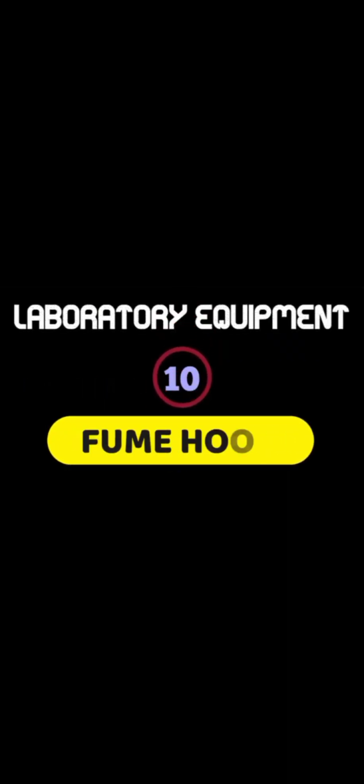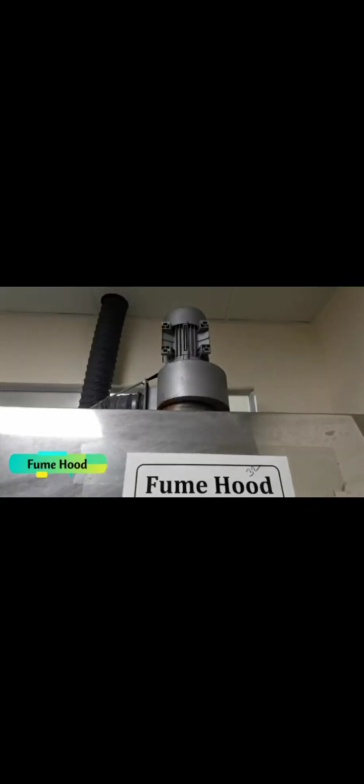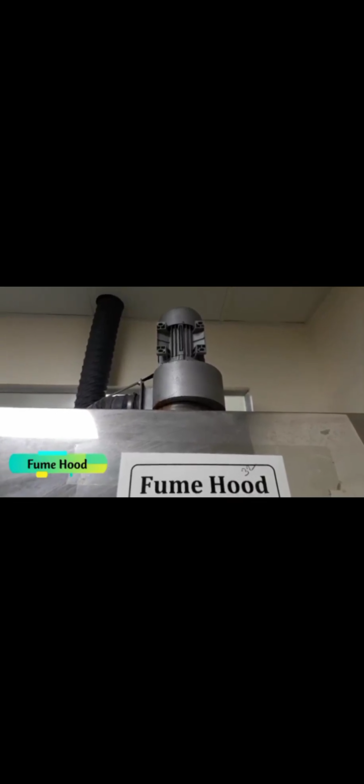Finally, number 10, fume hood. A fume hood or a fume cupboard in a laboratory is mainly used when the analysis involves hazardous or odorous chemicals. Whenever the analysis we are into involves releasing toxic or hazardous fumes outside, a fume cupboard or a fume hood must be used. Or when the analysis involves working in a closed chamber to ensure user safety.